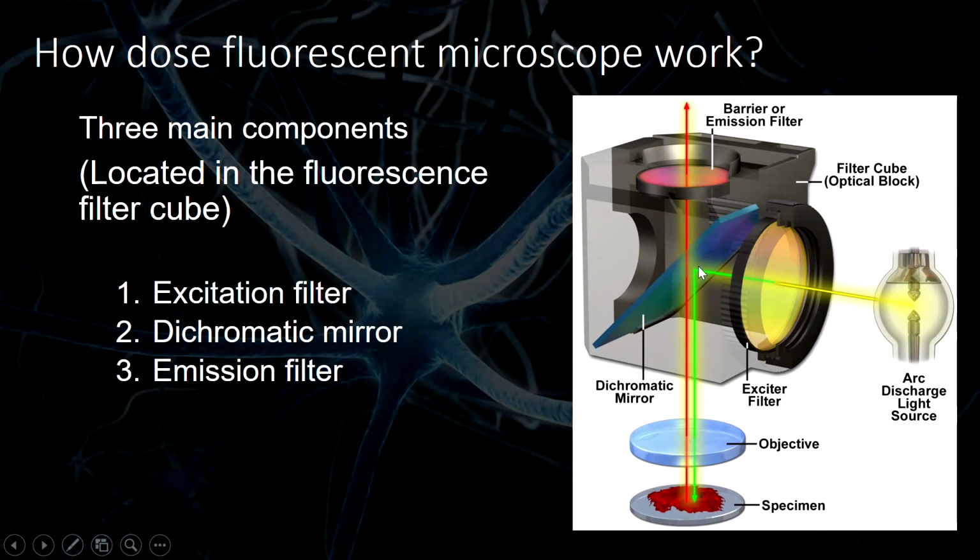So in this situation, this fluorophore will absorb green light and then emit red light. Red light has lower energy. So for this half mirror, the higher energy light, which is green light, will get bent, reflected, and then the red light will be able to pass through.